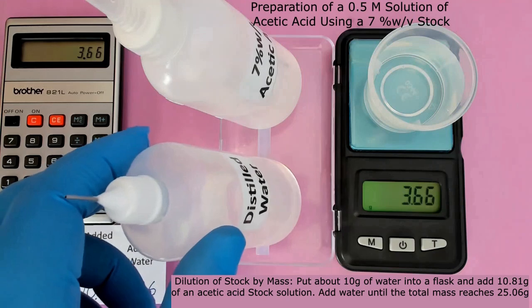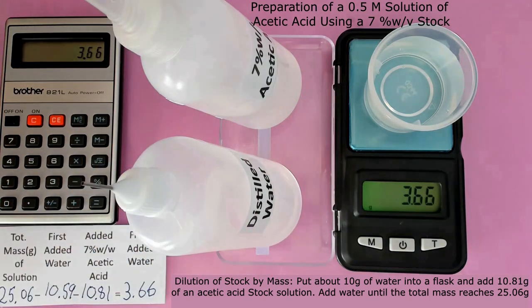This was the last step to create the solution, and now what we have in the cup is a 0.5 molar acetic acid solution.